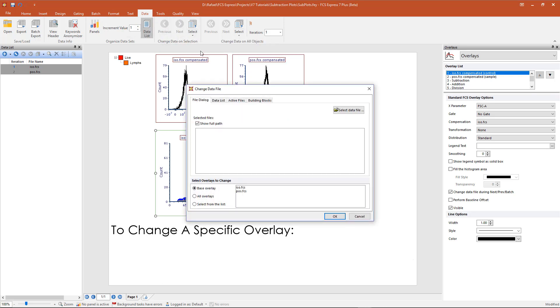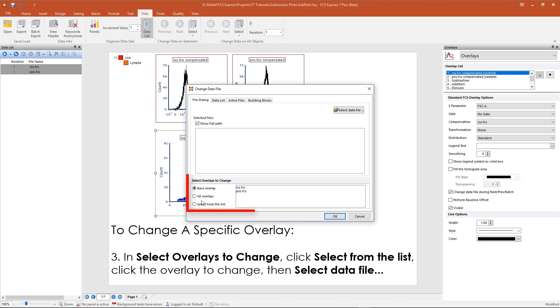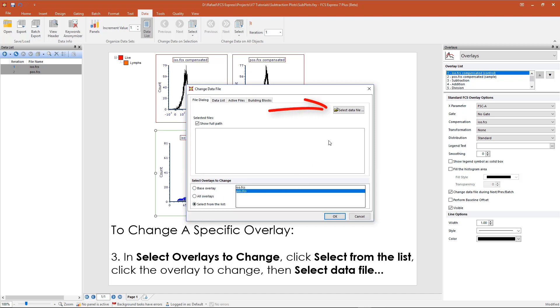This opens the change data file window. In the select overlays to change section, you can specify the overlay to change, then select the data file to change as normal.